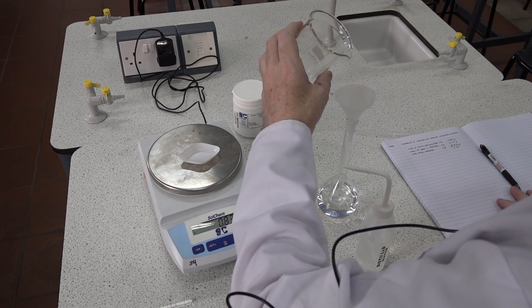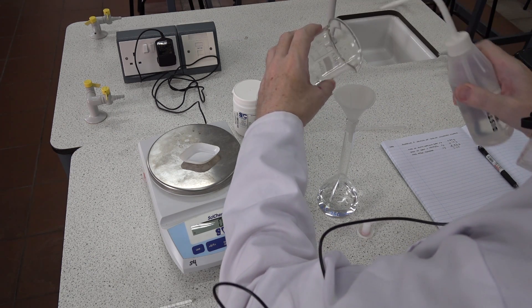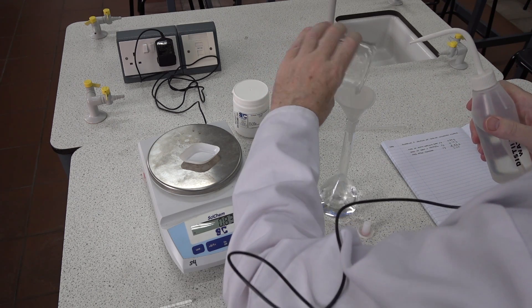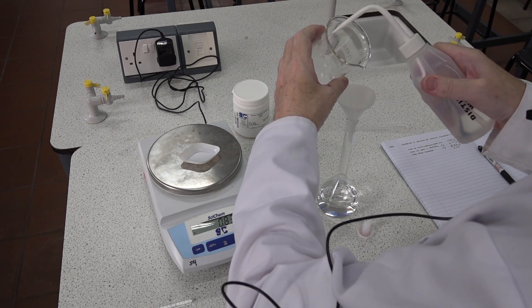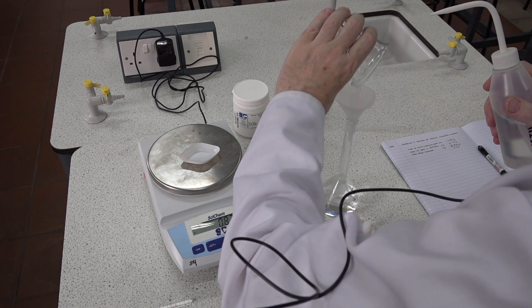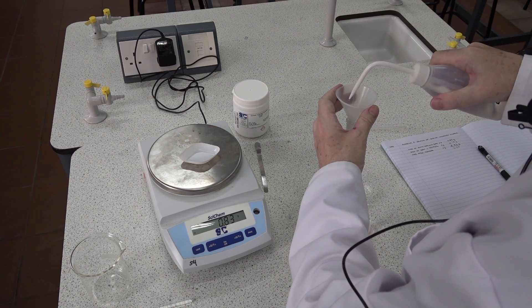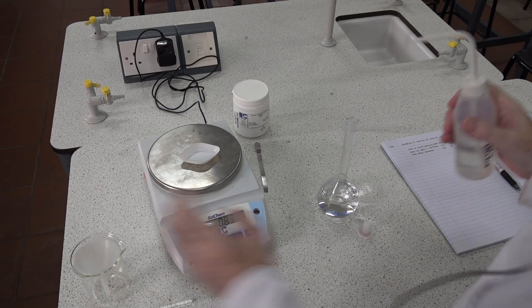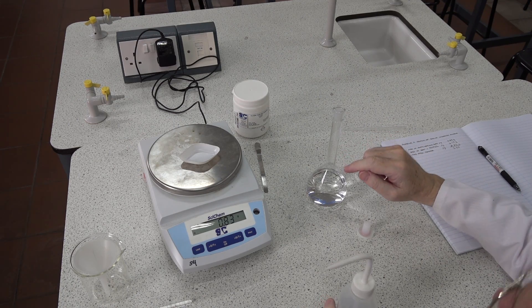Next we need to wash the beaker — good to wash at least five times, rinsing the walls of the container. Again, be careful not to touch the tip of the bottle onto the beaker. And the last thing — we can wash the funnel, sides of the funnel, just in case.